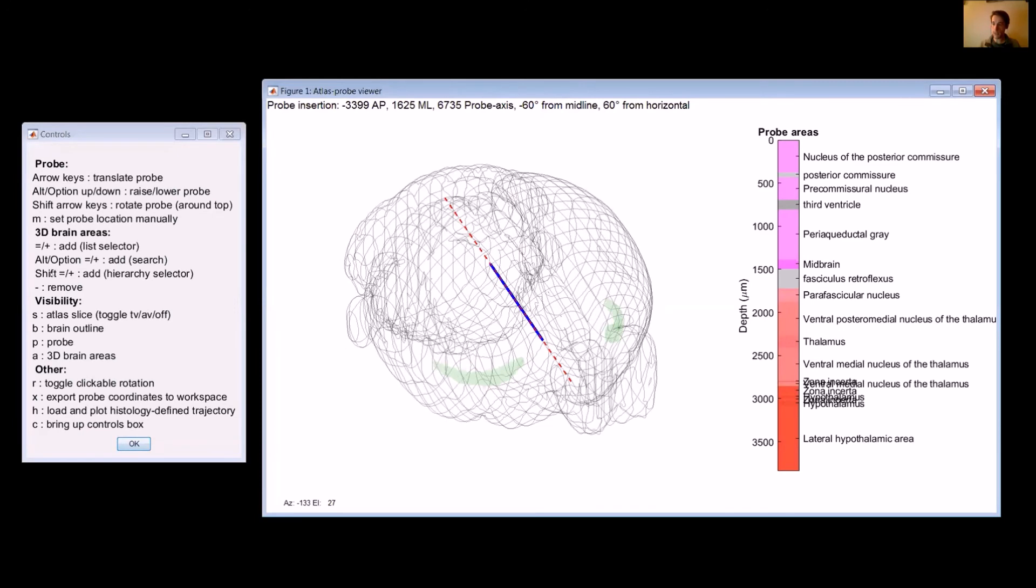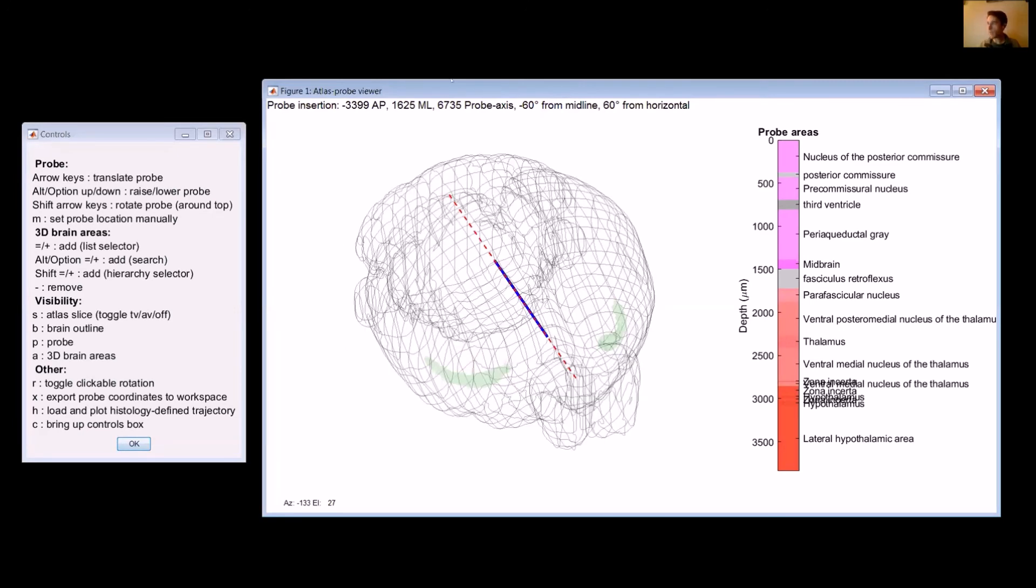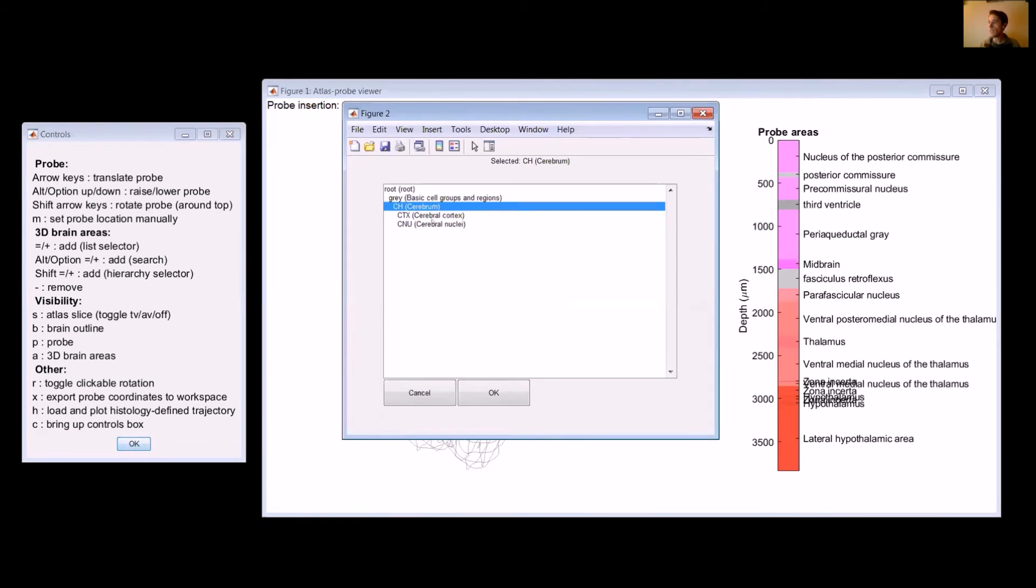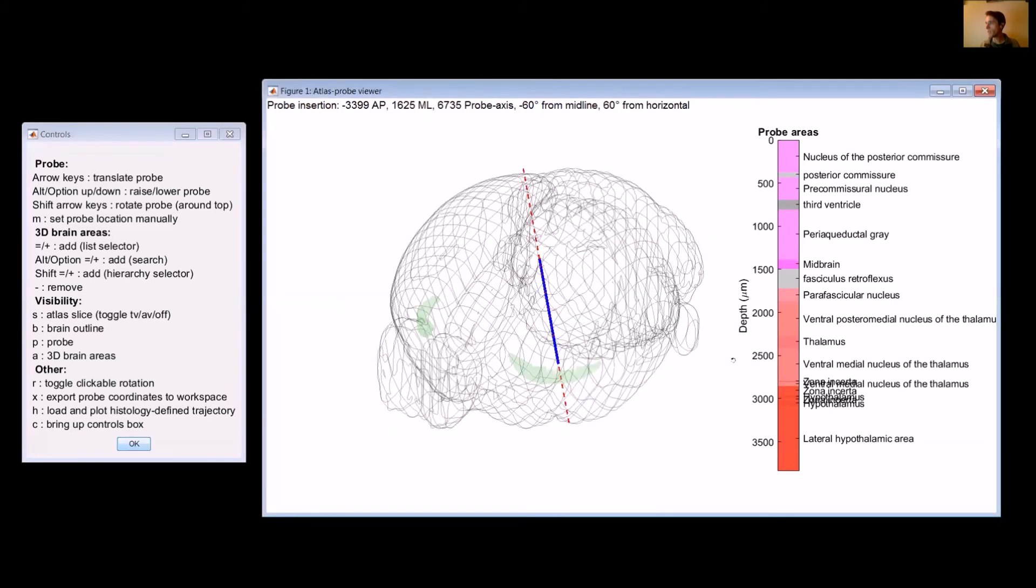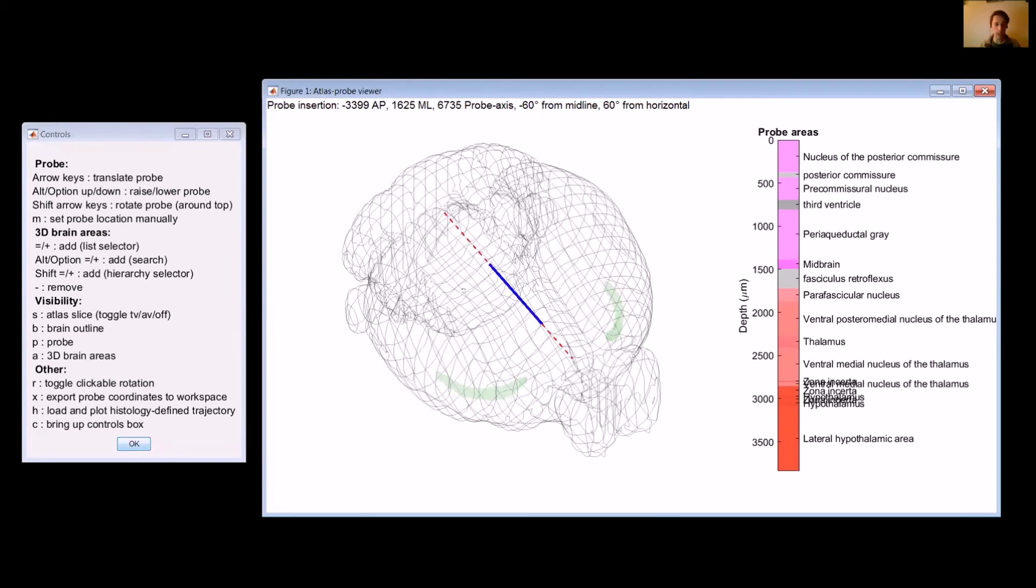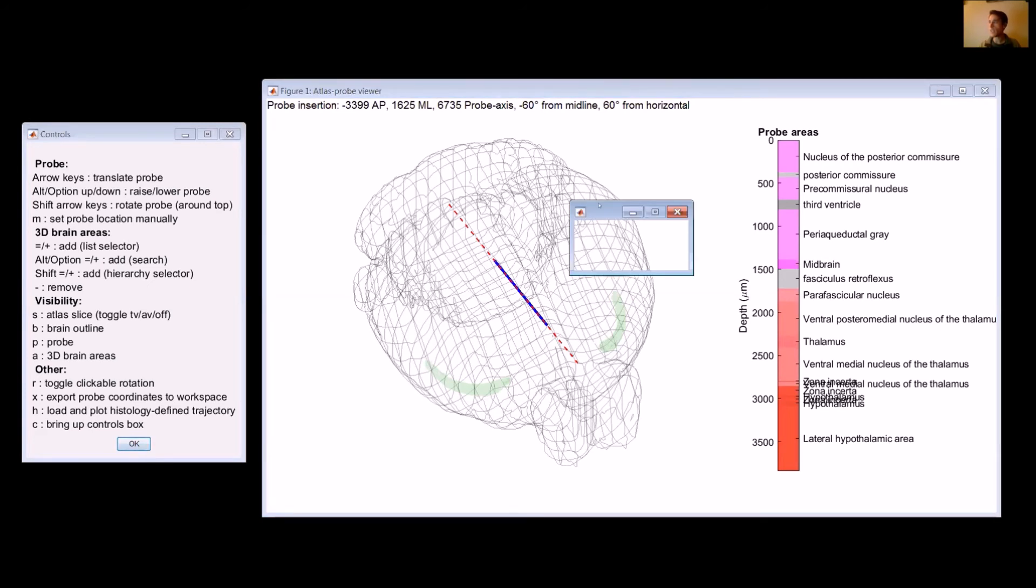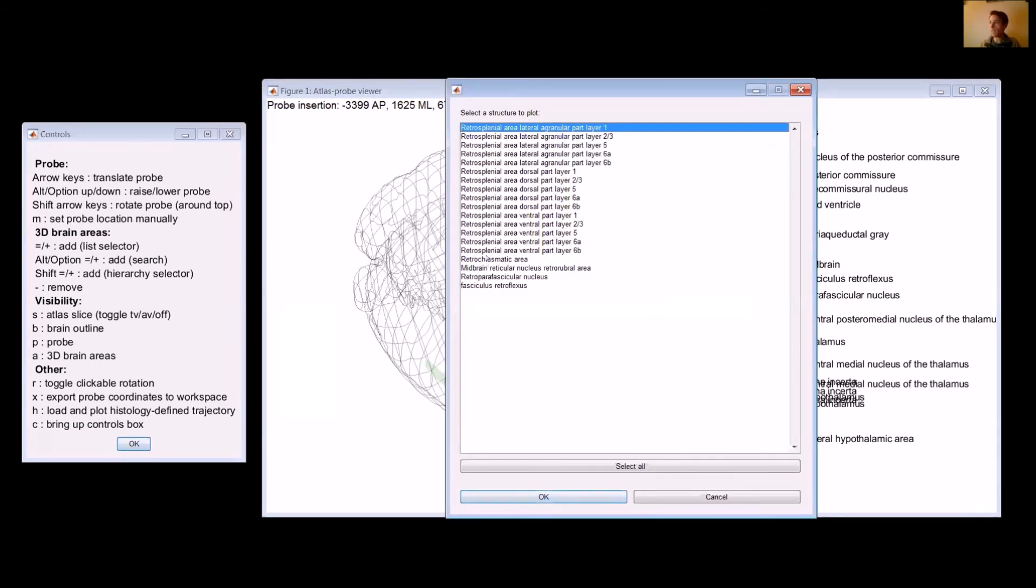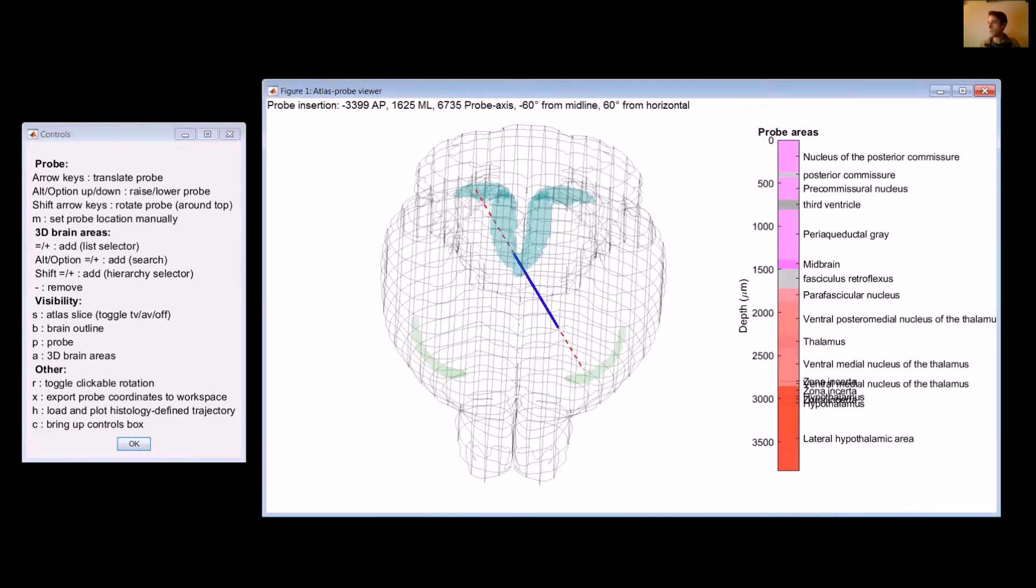You can also hold shift plus. And that brings up this hierarchy selector. In this case, you can go through each one of these categories. And then it'll show you how the Atlas categorizes these things. And then you'll be able to pick an area. So I just picked some random thing, but it goes down to the subiculum. We can pick that, which might not be close. So that was a bad choice, but whatever. The final thing is that if you hold alt, and then you do plus, you can also search for things. So let's say I want to search for anything with the name retro in it. Then it'll return retrosplenial, retrochiasmatic, whatever. So let's say we want to put in the retrosplenial. So then it'll show you the retrosplenial cortex. So that's how you add things.